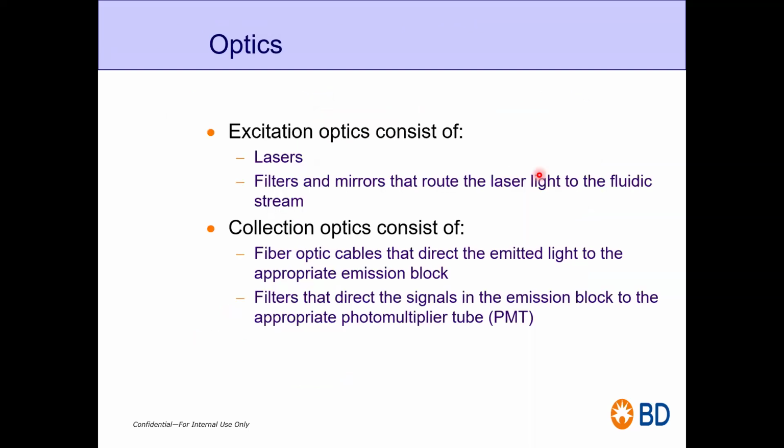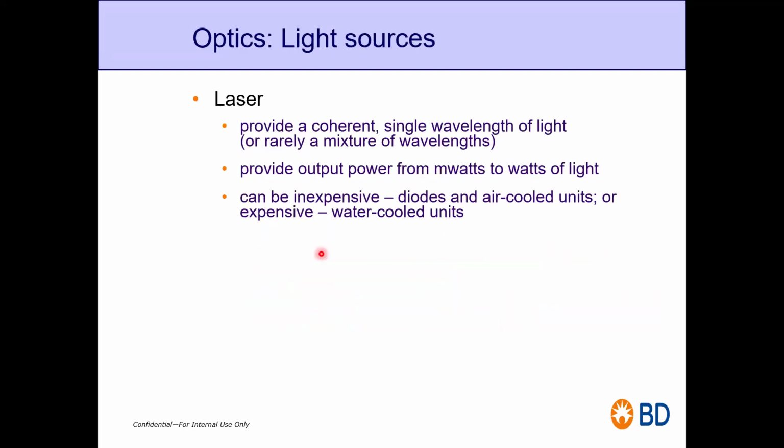Now let's go to the optics part. In optics, as I told you, you have two optics, excitation optics and collection optics. In excitation optics, you have laser, filters and mirror. In your collection optics, you have fiber optic cable, then your PMTs, and then your filters.